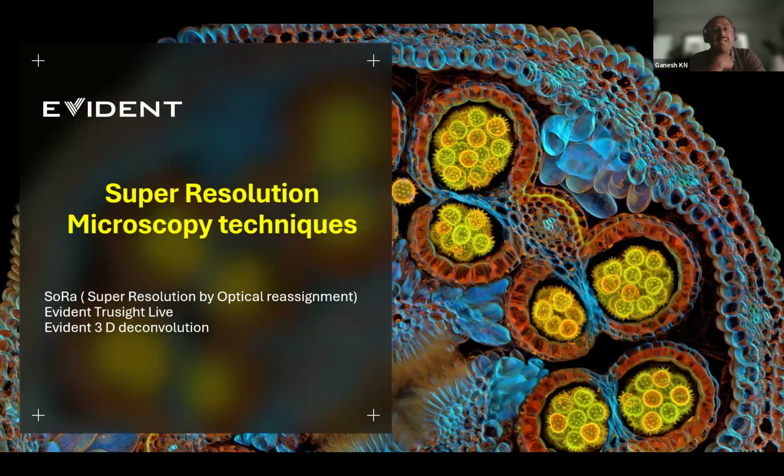So people started questioning, can we achieve speed with the resolution? Because most of these super resolution techniques were giving excellent resolution, but the temporal resolution was always compromised.